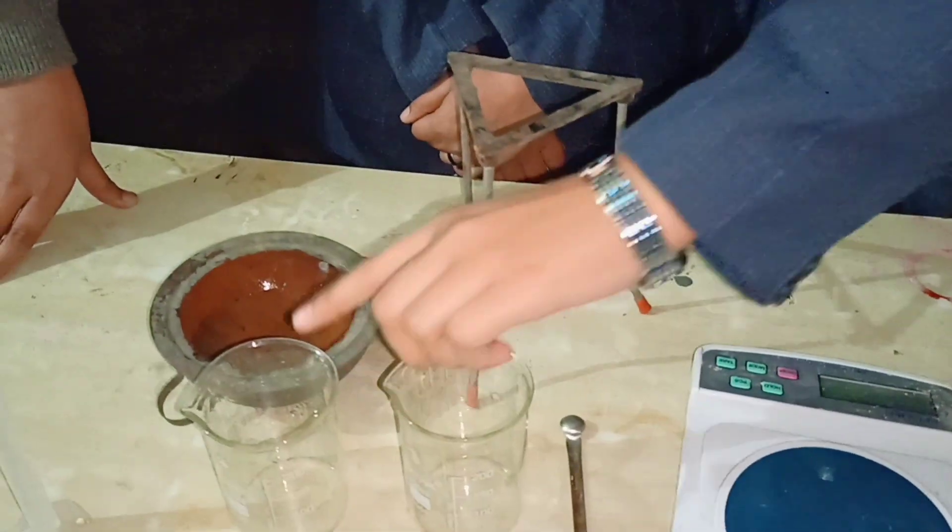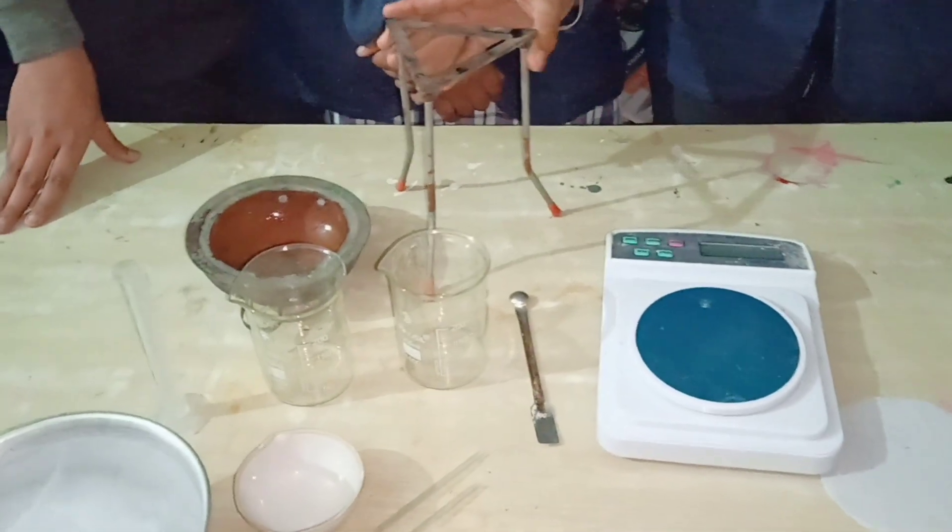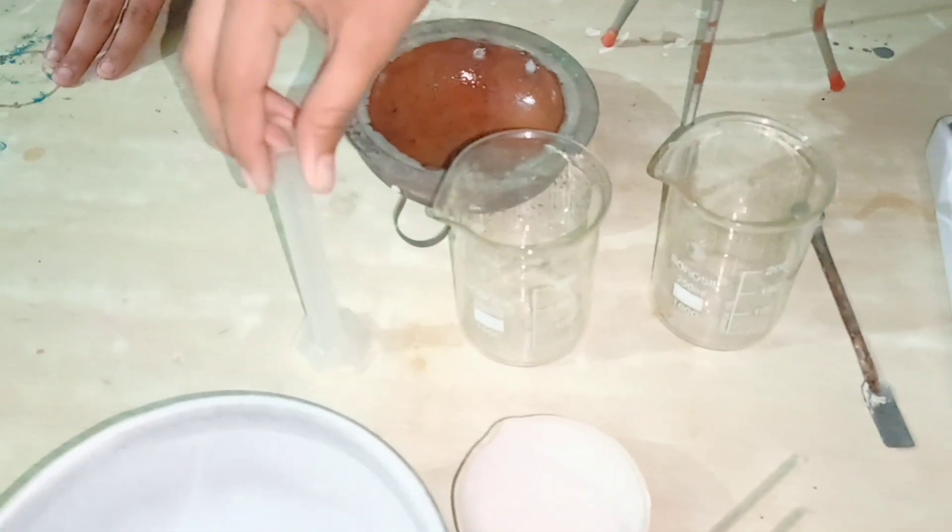There are two beakers, a tripod stand, water bath, and a 10 ml measuring cylinder.